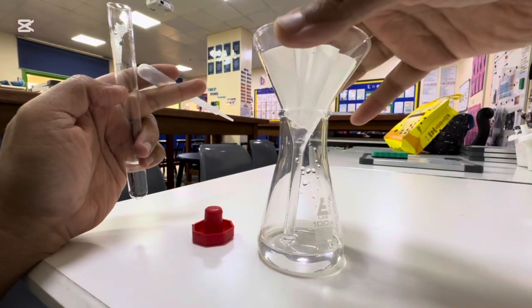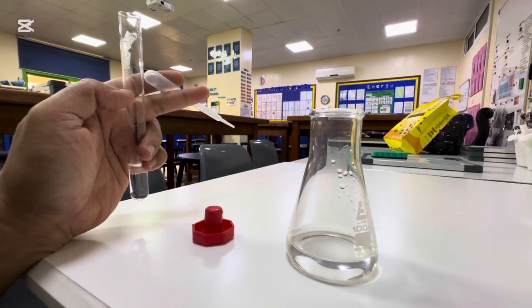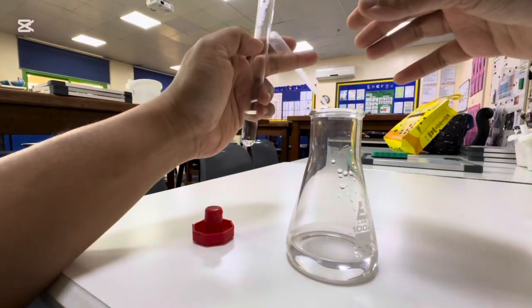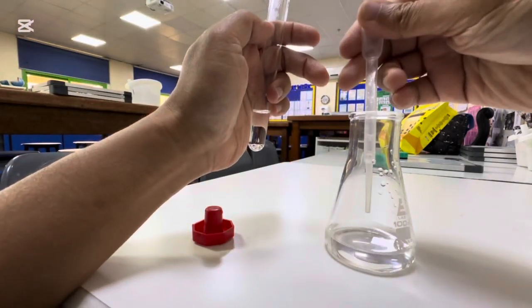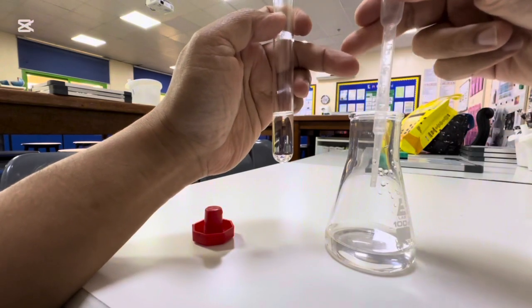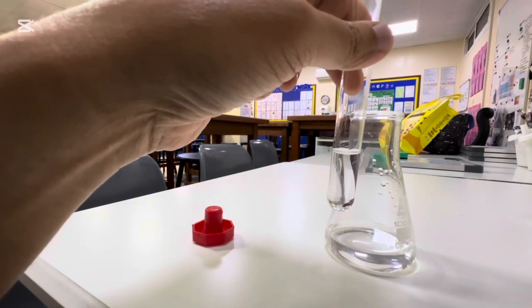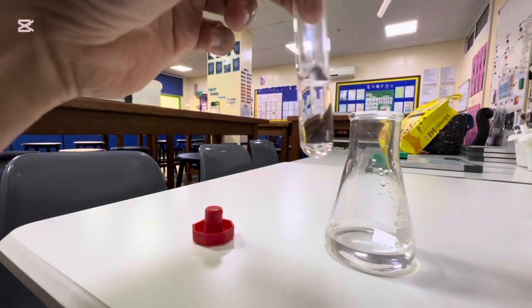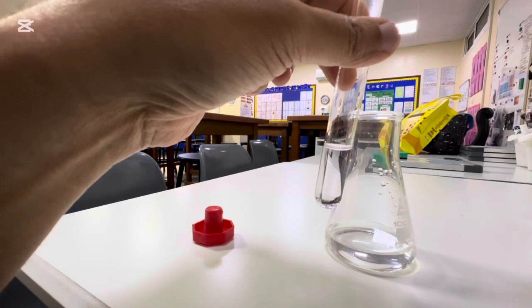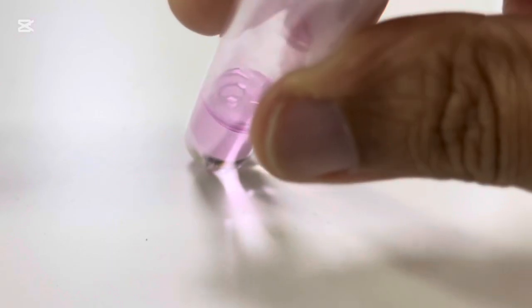For the final check, now that this has filtered all the way through, I've got some sodium hydroxide here, and phenolphthalein tested with sodium hydroxide should give you a beautiful pink colour. Let's just have a look at that. All you need is just one drop. I'll put two in there because I'm greedy. It is turning pink. And here we have that wonderful pink colour really coming through now, confirming that it is an alkali. Got a really, really good view there.